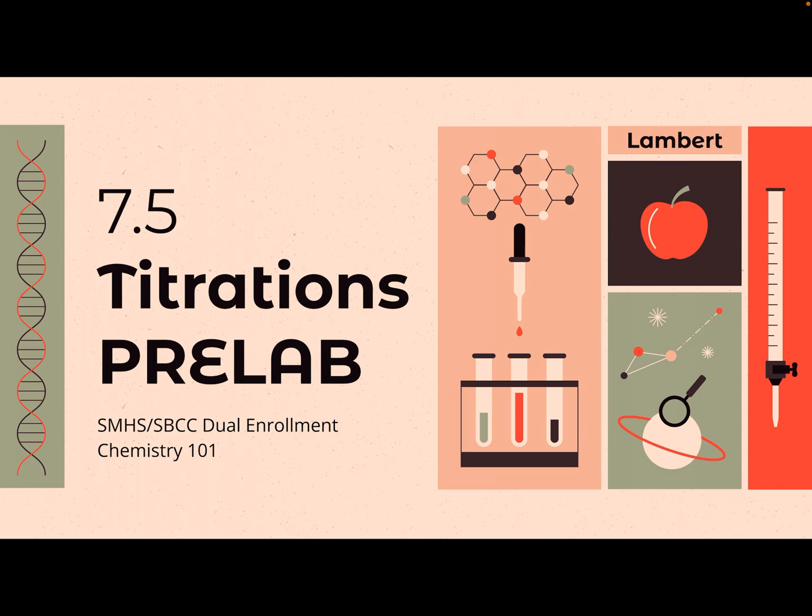So the last important skill that's going to come up in this unit is how to experimentally determine the concentration of an unknown acid or base through this process called titrations. That's really the key to this lab, all about the experimental process to determine concentration.